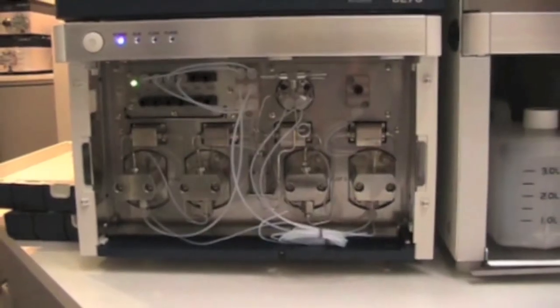Hitachi have developed a brand new algorithm. In this algorithm are tables for compressibility and solvents, and the four pressure sensors here feed back pressure on the pump heads into the algorithm to constantly adjust and keep the flow very stable in the system.